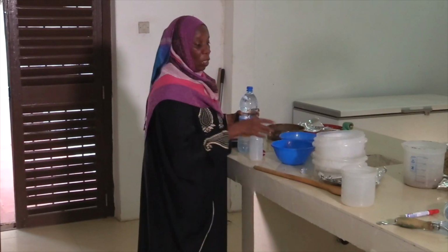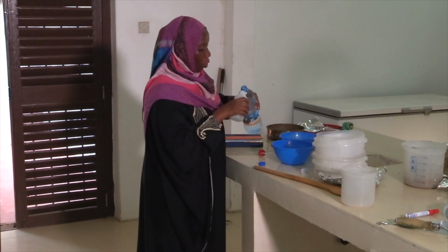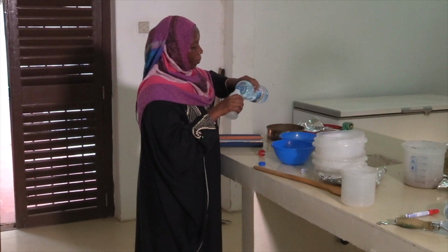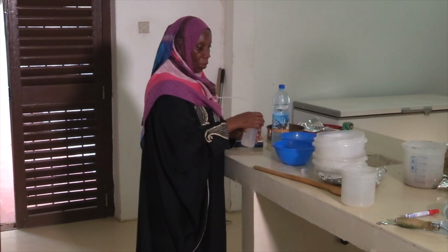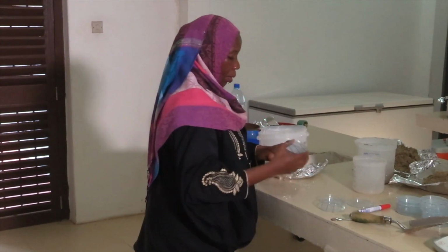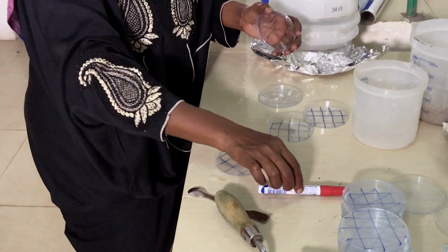For microscopic analysis, we use fresh water here, and we use dropper bottles. We put in some fresh water. The petri dish that you are going to use should be numbered.